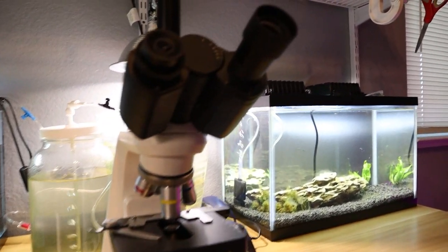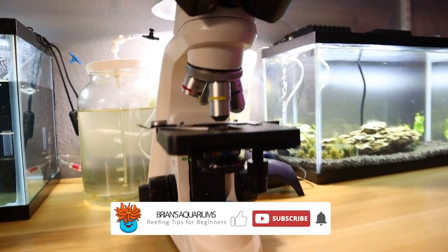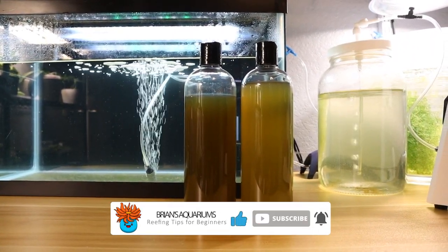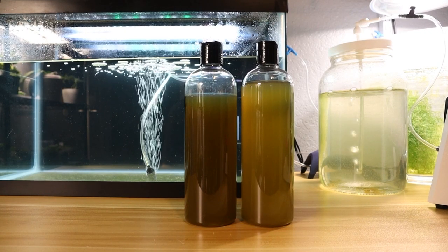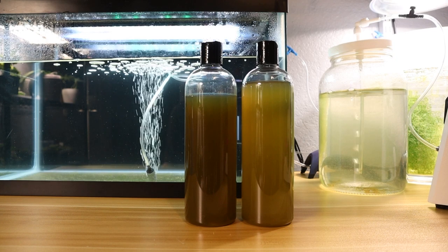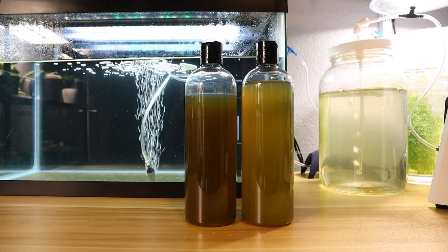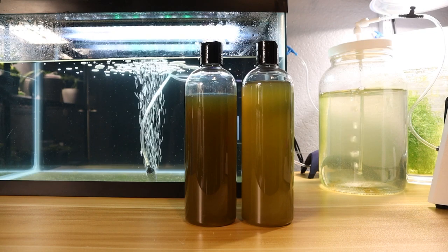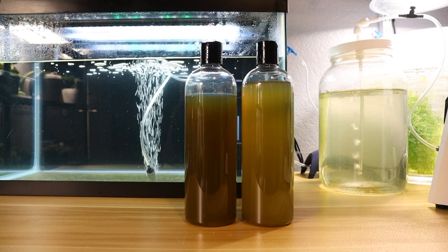I always look under my microscope whenever I get a new culture, just to see what I'm working with and to see if the phytoplankton is actually worth culturing. If it's too contaminated, I'm just going to dose it to my tank and that's it — I'm not even going to try to culture it because it's going to be too much of a hassle. So keep that in mind: whenever you're buying Isocrysis phytoplankton, you want to get a good quality starter culture that's not very contaminated.